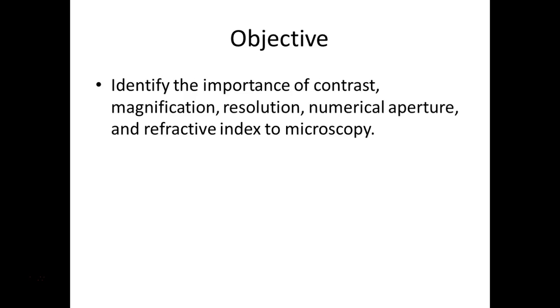right? Okay. So our next topic is microscopy, which is, of course, very important to microbiology because mostly we're studying things that you need a microscope to see, right, or other techniques. So as it applies to microscopes, how or why would you use, say, an electron microscope as opposed to the light microscopes we have here at Delgado?